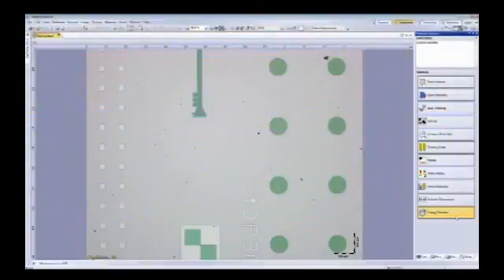Coating thickness is another new solution module. That one allows us to measure coatings that are put on the surfaces. So a lot of times metals will put a coating for surface matte finishing, and they'll want to measure those thicknesses. That can be done here. And I'll show you that as well.